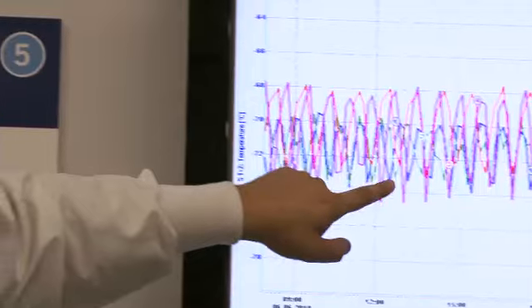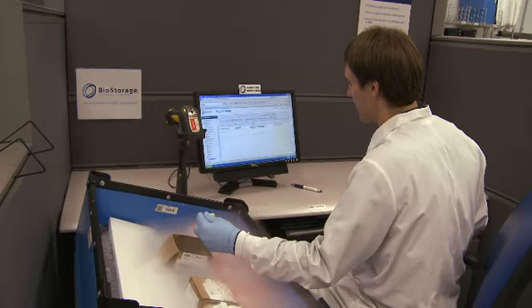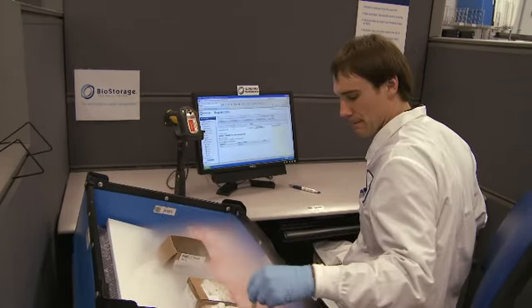We've invested in some very sophisticated systems to record temperature, to ensure that the temperatures are maintained at the correct level. We're ranging from ambient right through to very significantly low temperatures with liquid nitrogen, through refrigerated temperatures at say -70 or -80 centigrade. And all of this is recorded for future analysis to confirm that the samples are being kept correctly. And we also have built a very sophisticated software system to locate samples and also to maintain the data that could be associated with the sample, the age of the patient, the disease of the patient that the sample came from, and so on.